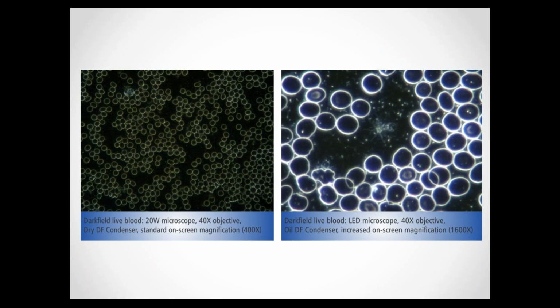So I don't think it's a case of microscope suppliers intentionally deceiving people, claiming to sell dark field microscopes that are not suitable. It's simply that they don't know what really is required for viewing live blood in dark field. Oh, I see. So they actually don't know what's required, and that's why they're simply saying they're good for dark field.